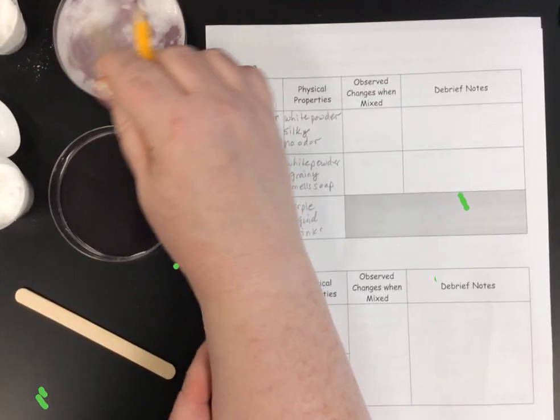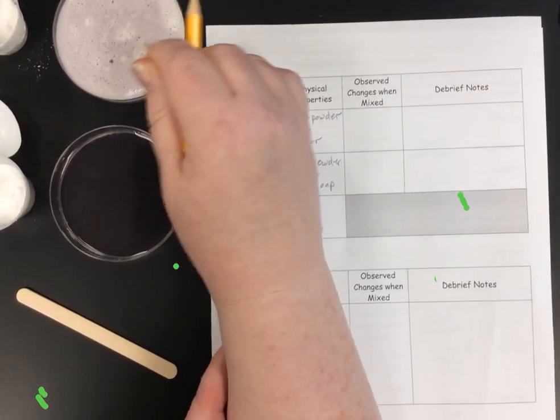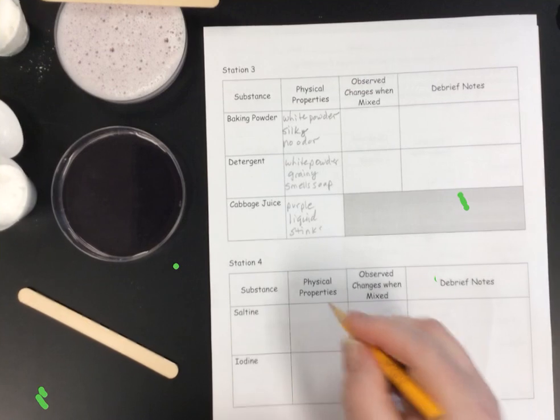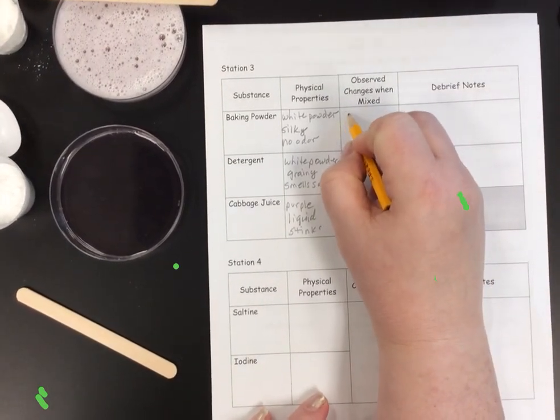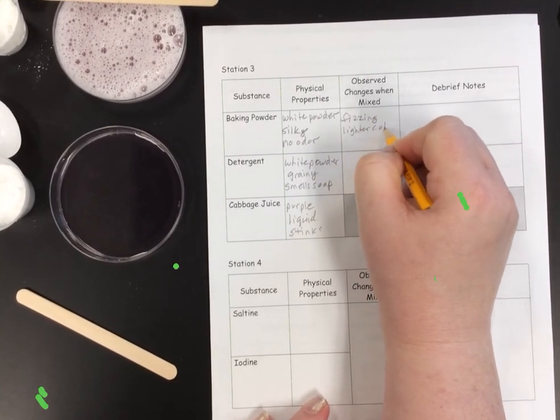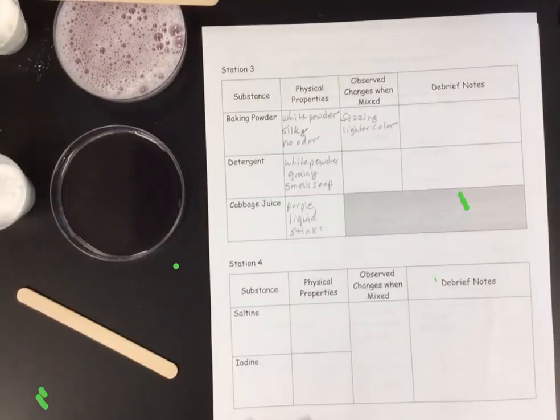Is anything happening? Well, it's fizzing. I see some bubbles. It's getting lighter. I think it's even lighter than the antacid was. So baking powder is fizzing, which means bubbles, and the purple is a lighter color. It's more like a lavender color, if y'all know what that means.